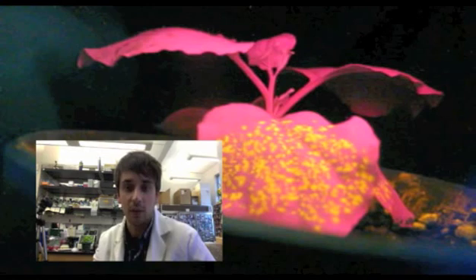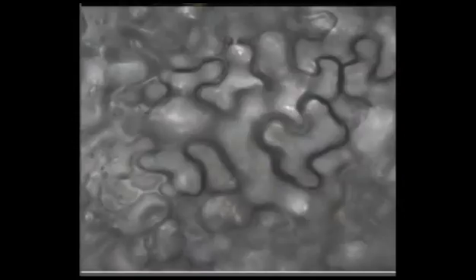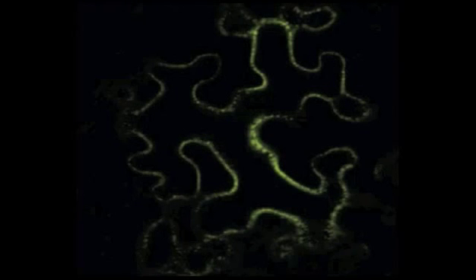So let's check it out underneath the microscope. And so I took these images a couple days ago. So this is an image of a cell when you just shine regular light on it. So you see this kind of like little puzzle piece looking shape outline on here. And then here's what happens when you shine UV light on this cell. Oh, so you guys see kind of that outline there. So if our DNA that we put in there tells the cell how to make our protein, and attached to that is a molecule that fluoresces, we should be able to tell where in the cell our protein is. And so here's what it looks like when you overlay the two images.